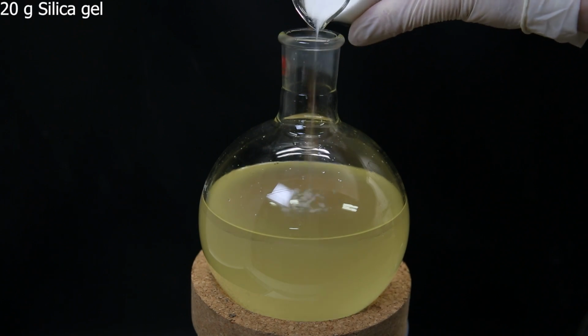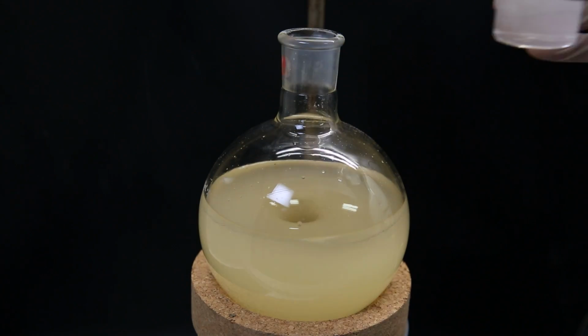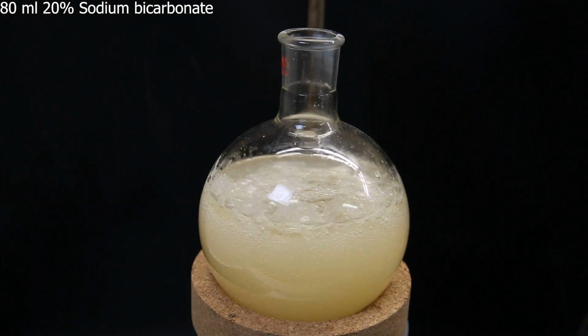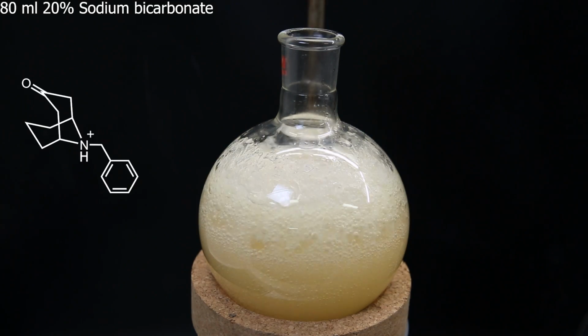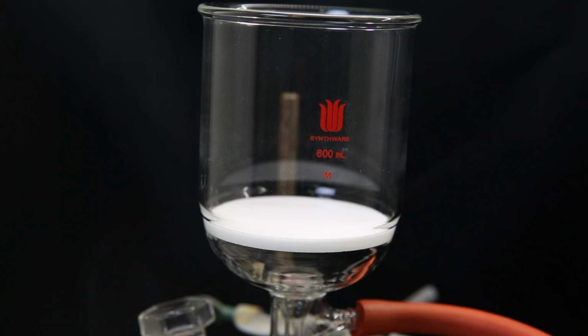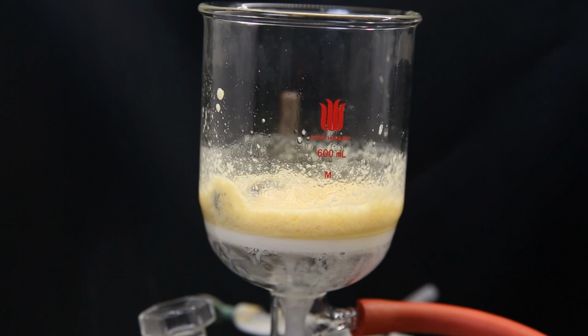I then add 20 grams of silica gel, which will hold on to any solid impurities. I then gradually add 80 ml of a 20% sodium bicarbonate solution to adjust the pH to 8. This causes the amine of the product to deprotonate and move into the heptane. I then take the mixture and filter it all through a glass-fritted filter with vacuum filtration.